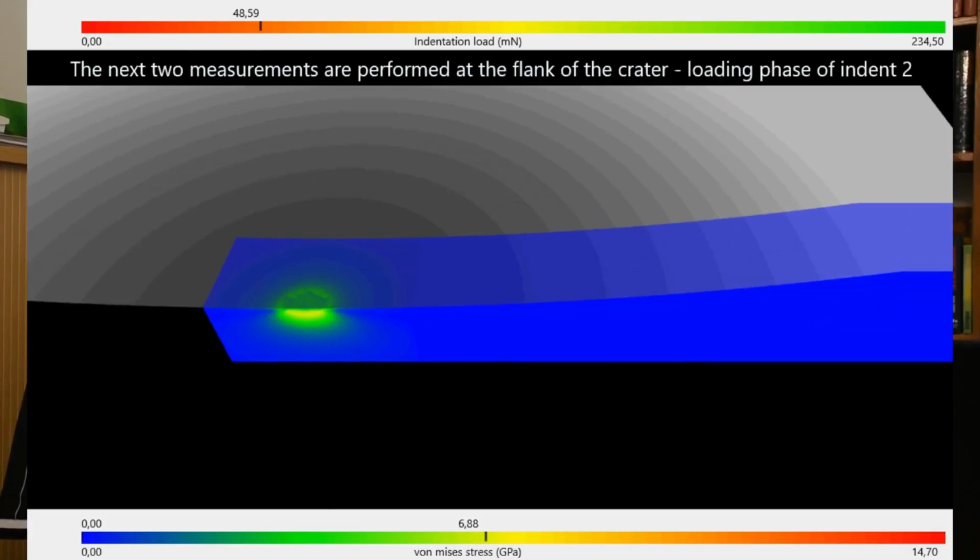Julius told us in the last video that we can also scratch in the Calotte crater. So this is going to be the topic of today's video. So I want to ask, how exactly does that work with the scratching? So you want to know the basics of scratching? Yes, please.